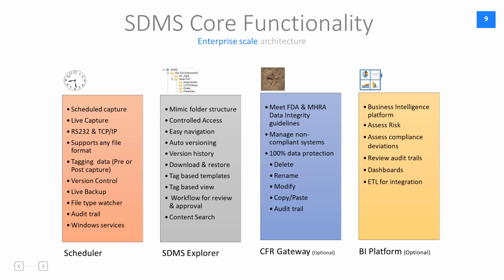You can set up the scheduler to watch Excel files generated by the particular computer or laptop at any location inside the desktop. The moment a file is generated, the Logilab scheduler will know that you have generated the Excel file and it will automatically upload it to the server.